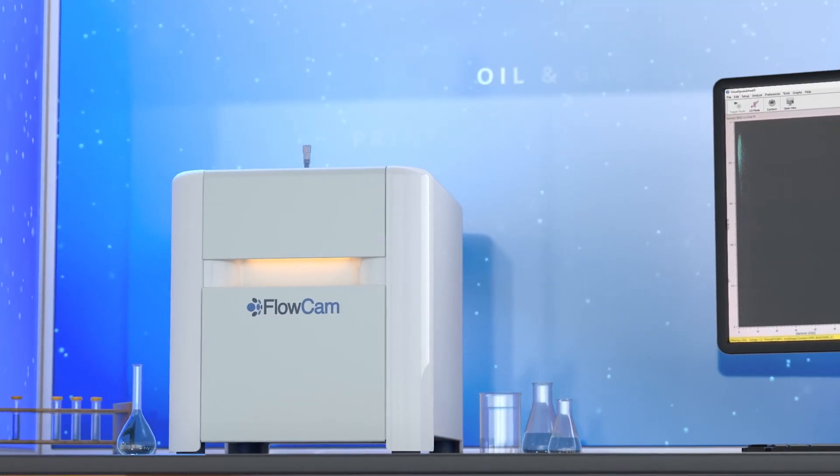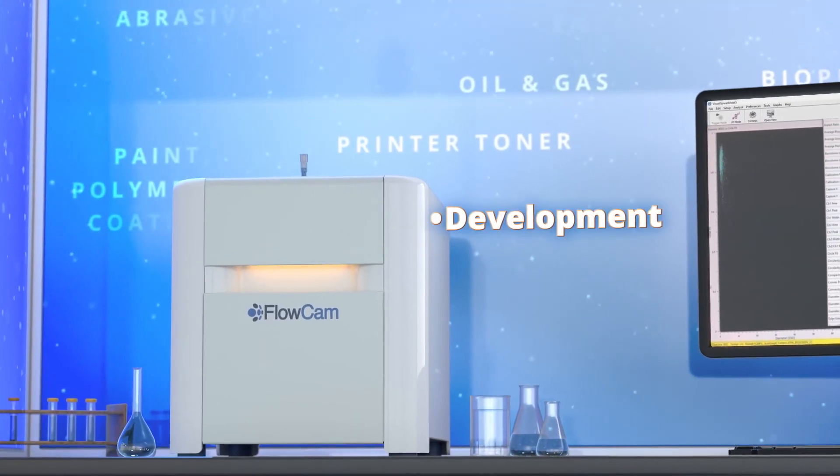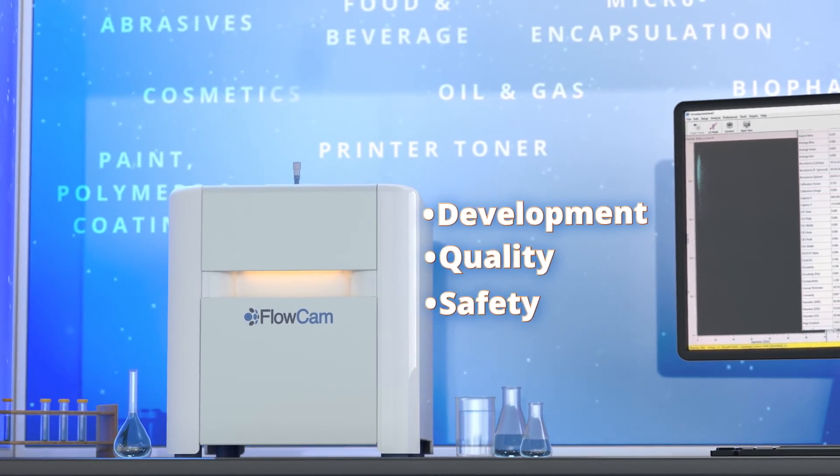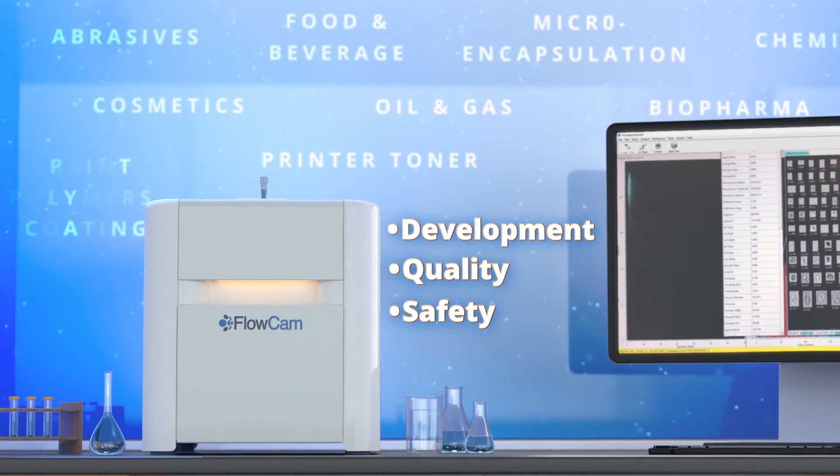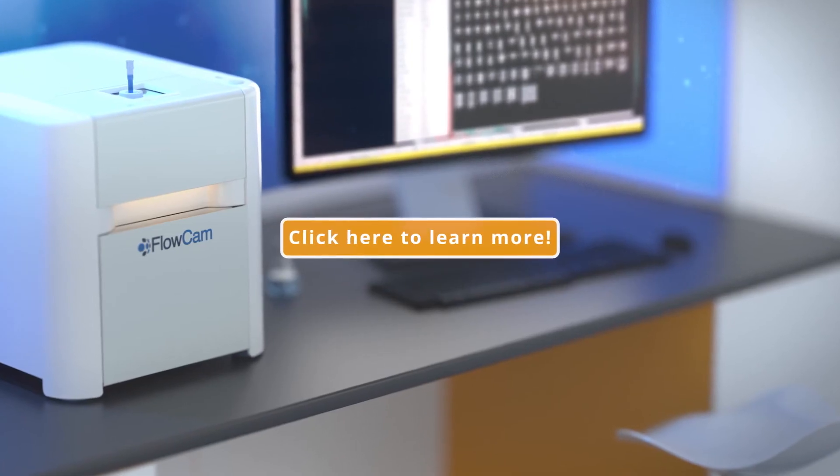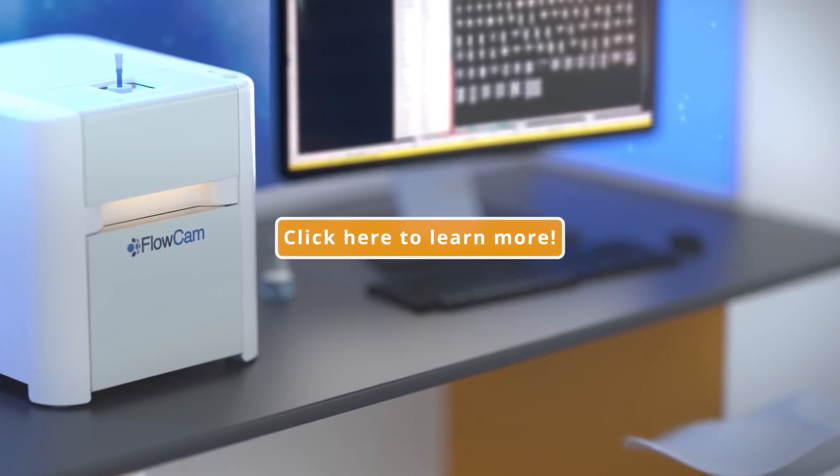Countless industries are using the FlowCam to improve development, quality, and safety of their products and formulations. If particle analysis is important to your business, click here to see how the FlowCam can deliver the results you've been missing.